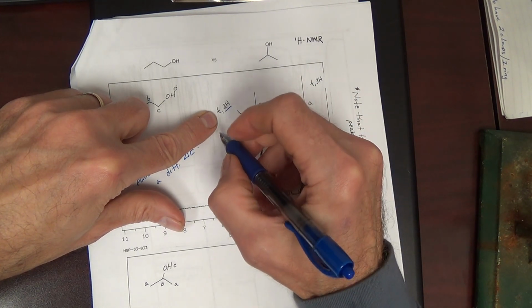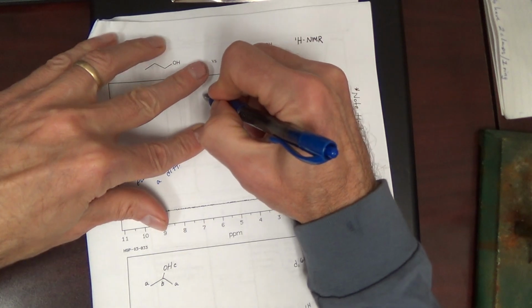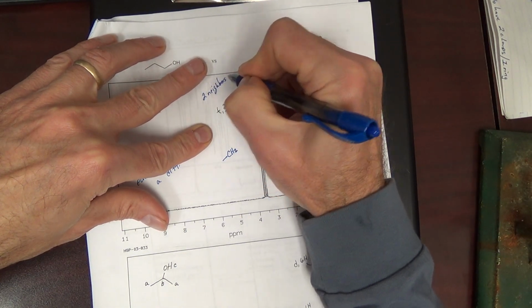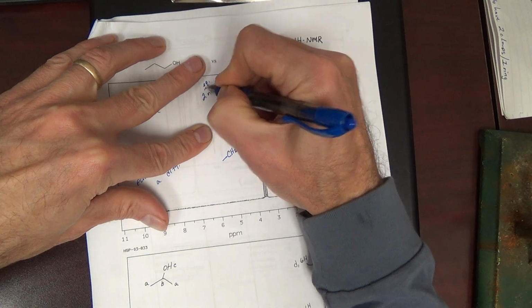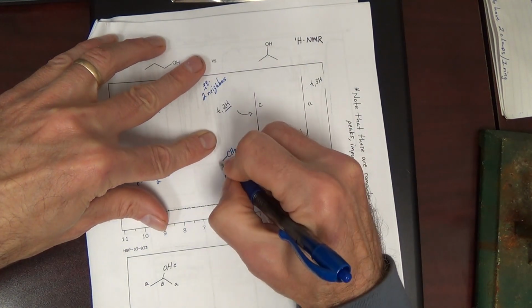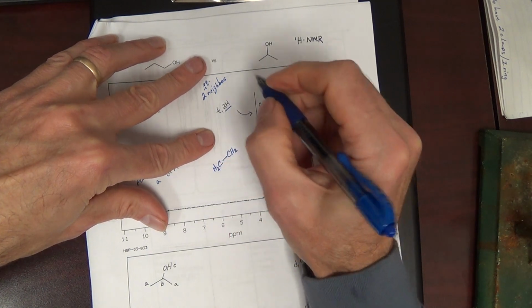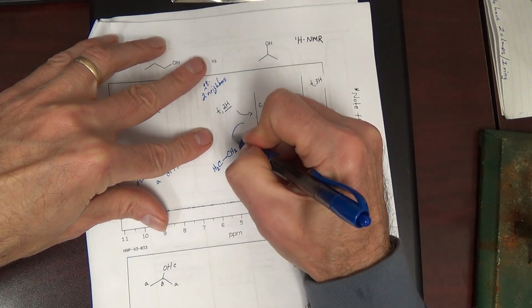It turns out that it's got 2 neighbors, or 2 equivalent neighbors. That's what makes it a triplet. And so it's a CH2 neighbor. And so this is the signal.